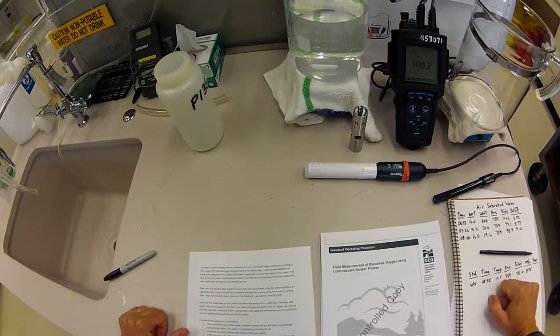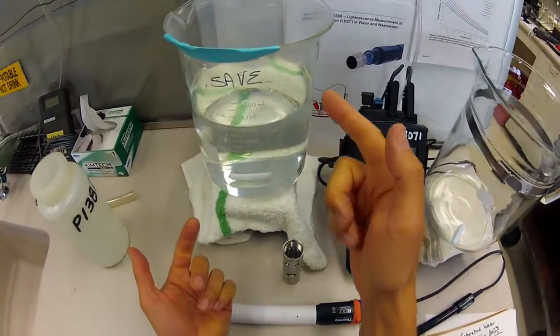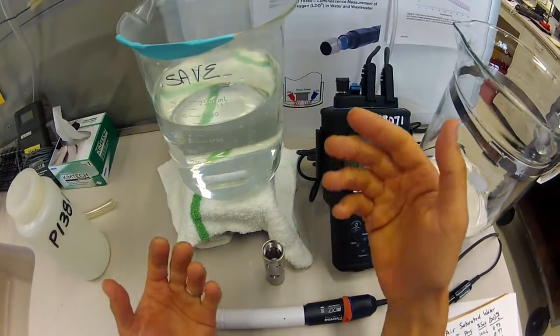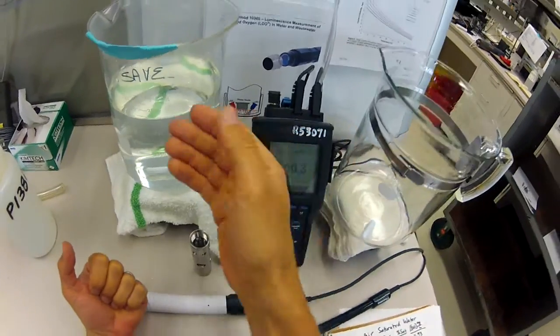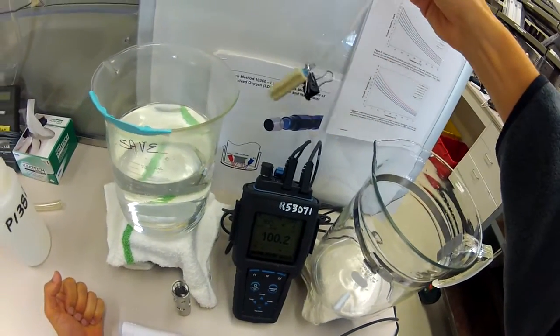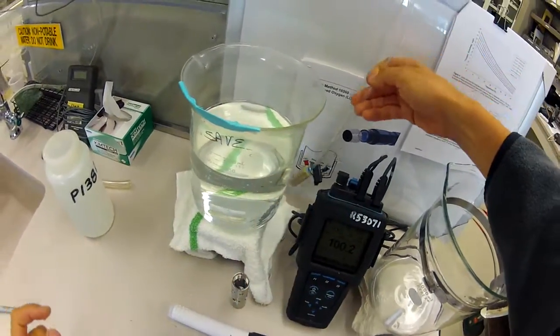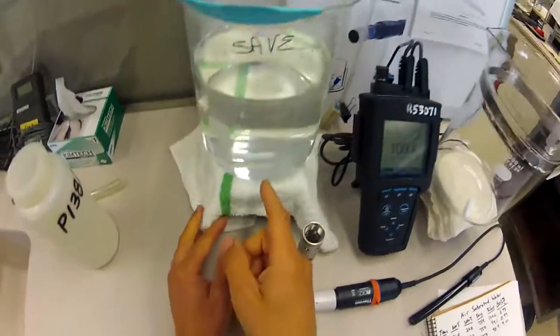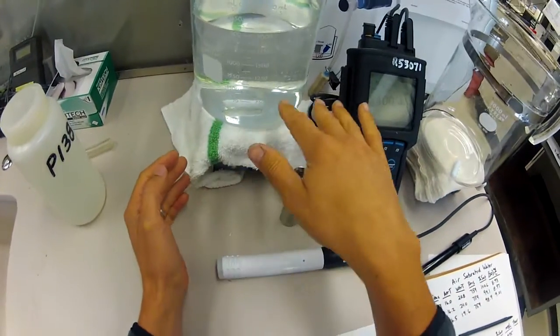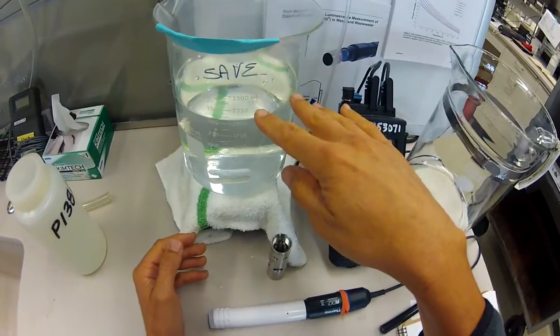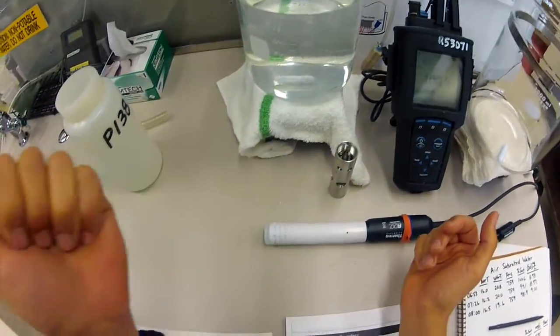The process of equilibrium for air and water is not instantaneous, so we try to speed the process up. We use an aquarium pump to deliver air to the water. We use a diffuser stone and a regulator. We use a stir bar with a stir plate to help make sure that we bring all the water up to the surface so that it has a chance to have contact with the air.